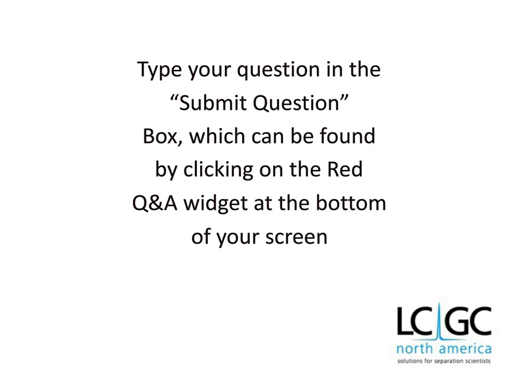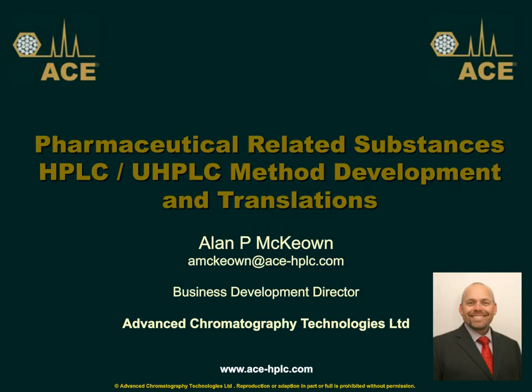Okay, first question, Alan. When you talk about the ACE-PFP, you mentioned shape selectivity. What do you mean, chiral?